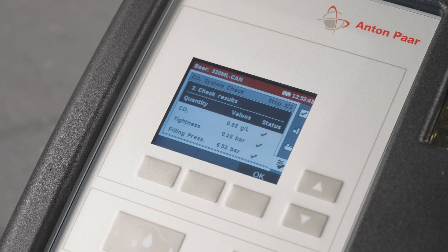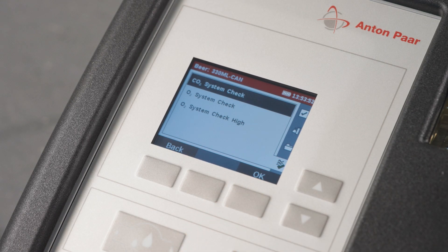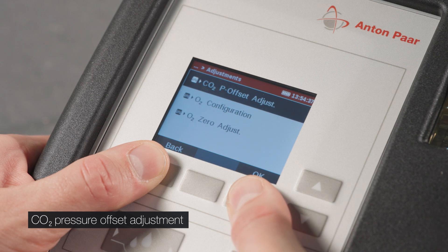You can confirm the successful check results. If the value is out of tolerance, clean the instrument and repeat the CO2 system check. If the issue persists, you need to perform a CO2 pressure offset adjustment.